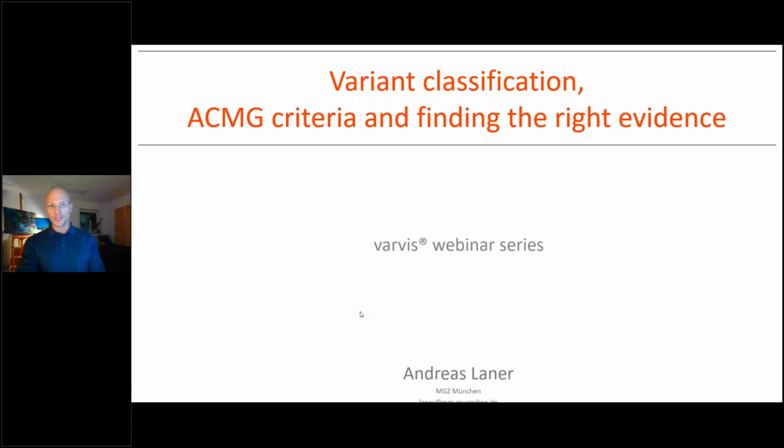And yeah, such modifications of gene or disease-specific ACMG codes is indeed a very important topic, and I will come to this later in my presentation.